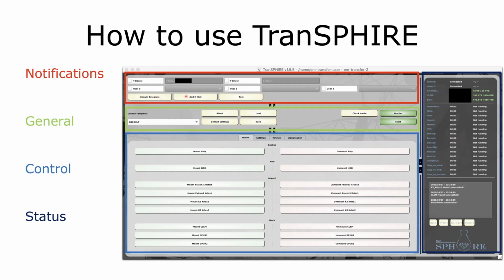So this is communicating via a bot. If it has any messages for you, like there are new class averages, this hole or this square doesn't produce too many particles, or the drift is exceptionally high right now, then it will send the notifications to the checked users here.